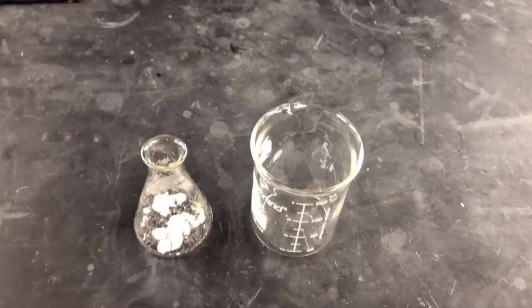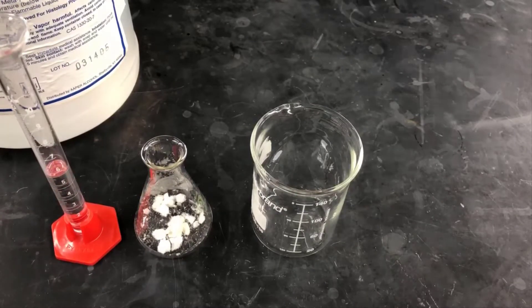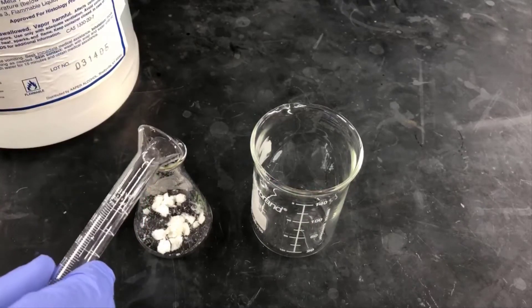To start off with, I'll be measuring out 6 milliliters of xylene and pouring that in. This is the good solvent, and adding 6 milliliters of xylene nearly dissolves the product.